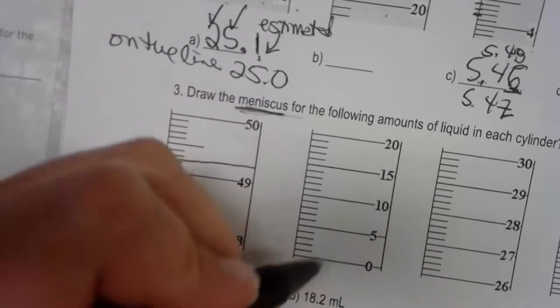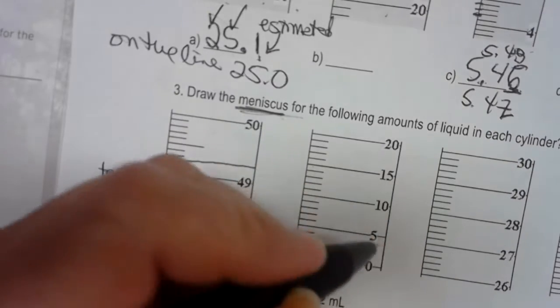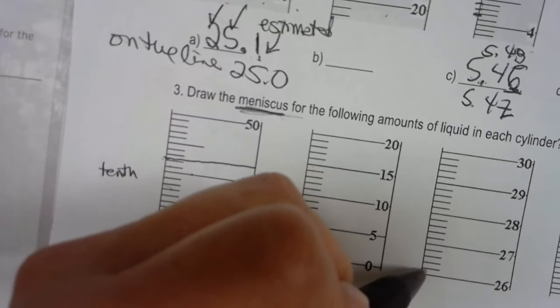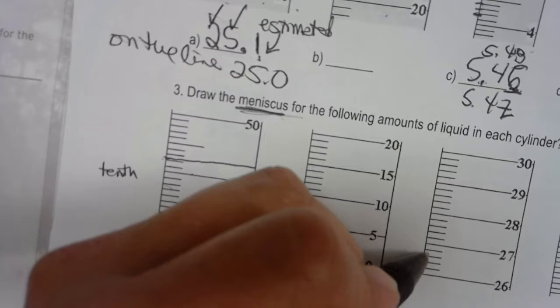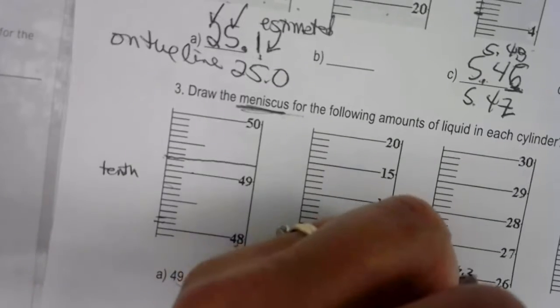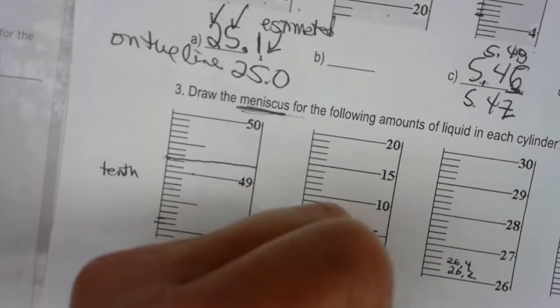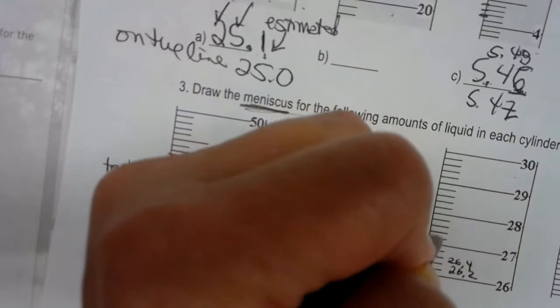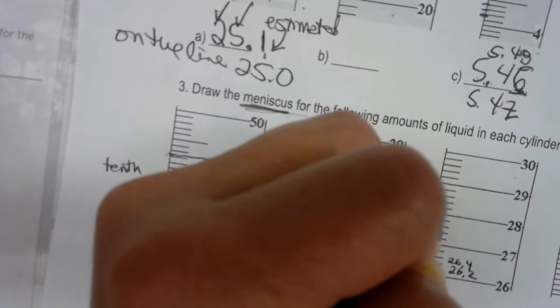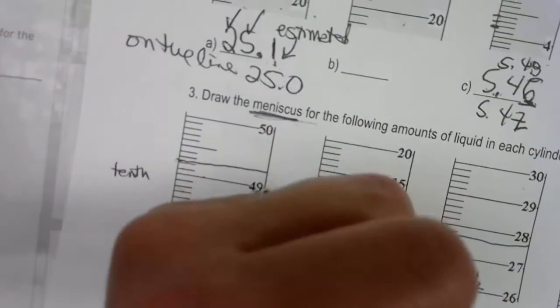Okay. Now, when you do this one, every line is 1. This is like 1 mil, 2 mil, 3 mil, 4 mil, 5 mil. But here we're actually getting into some tenths. Because there's only 5 units, this is the 26.2, and this is like 26.4, because there's 5 units, but you're trying to go to 27.6 and you're just a little tad above the 6. So this is 0.2, 0.4, 0.6, so you're a little bit above it. Okay, and so you're going up that way, and that's going to be your answer for that.